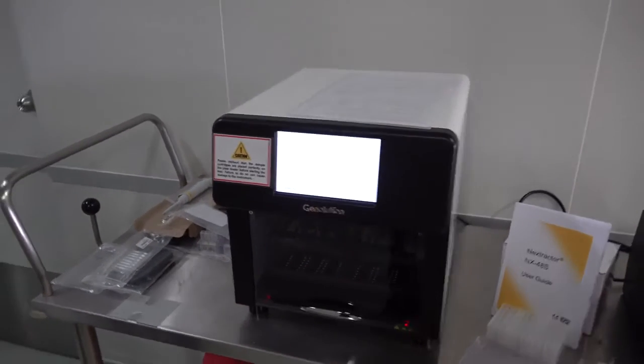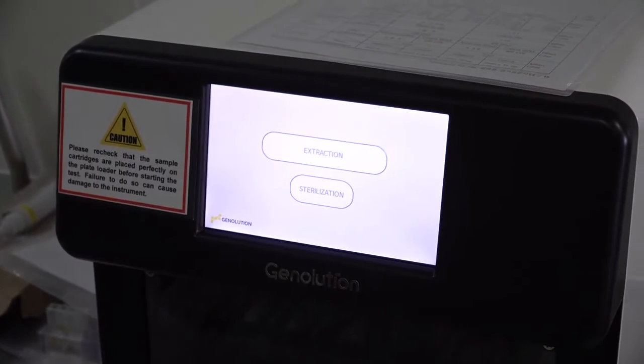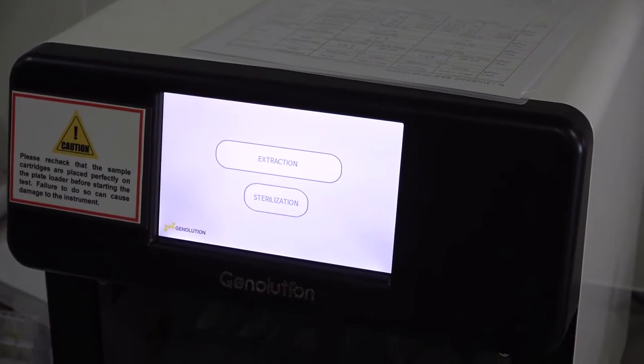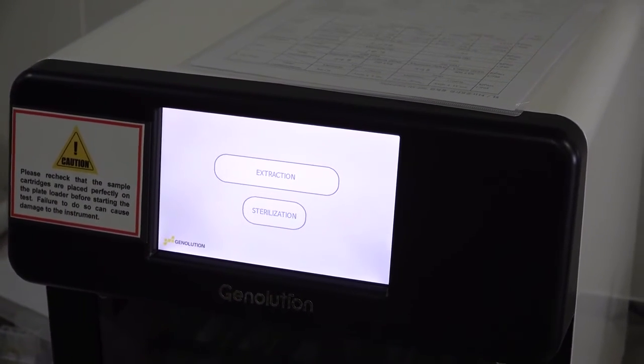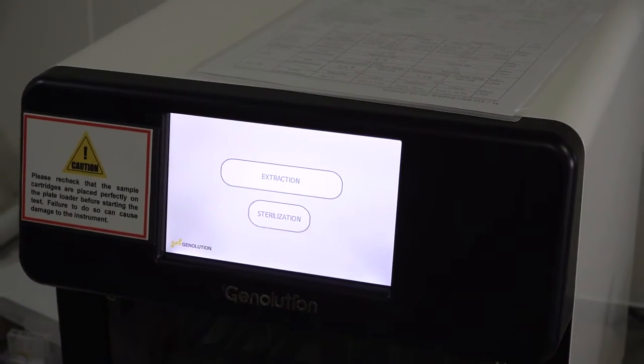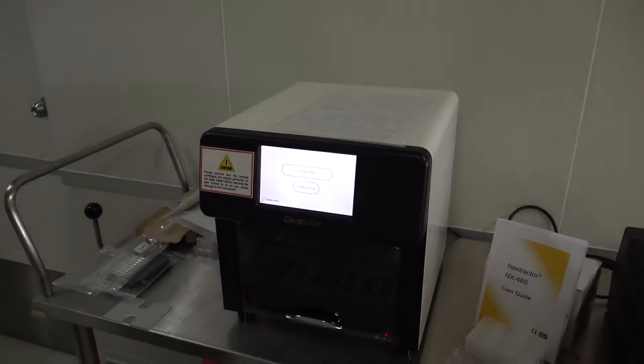When you begin you can start the machine and your screen will pop up. It's relatively simple to see you have two basic procedures. One is extraction and sterilization. I will now turn to Ms. Aini who will demonstrate to you how the unit is actually used.